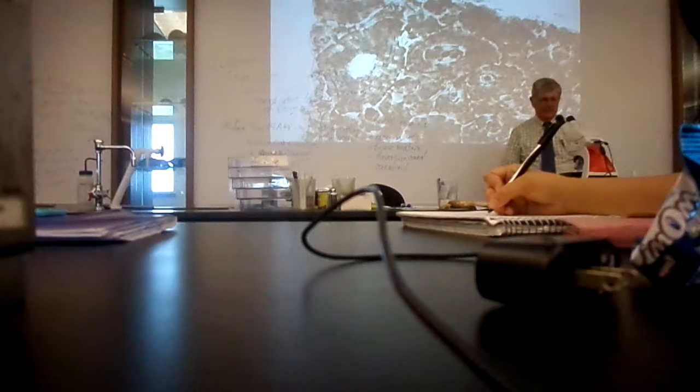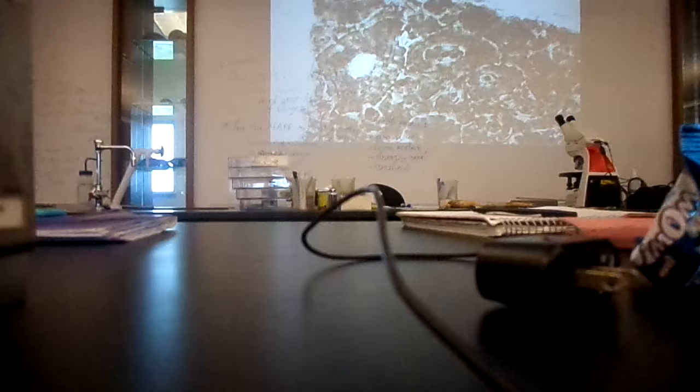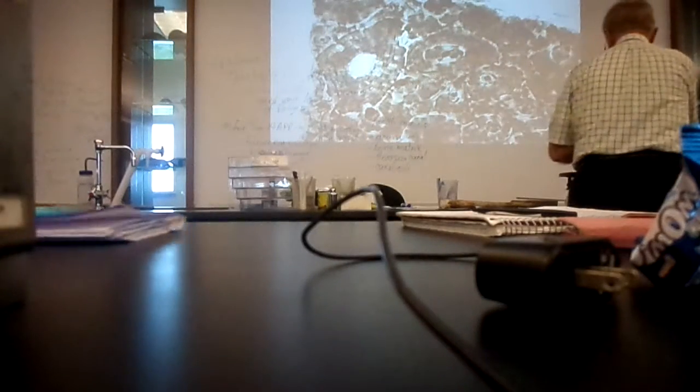All right, now, some other aspects of the human skeleton that you are responsible for is in the lower left corner of the screen here. Let me turn this off. Over here on the cabinetry, there's a stereoscope.